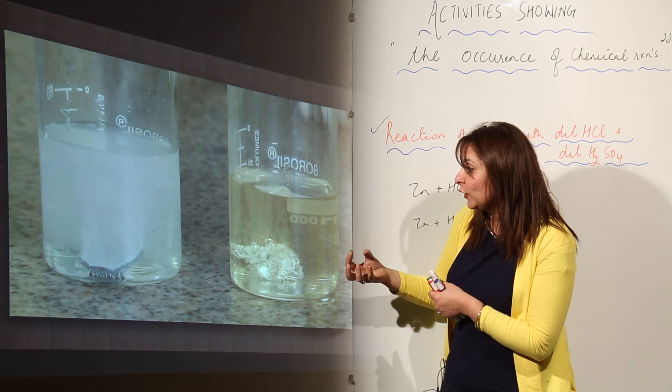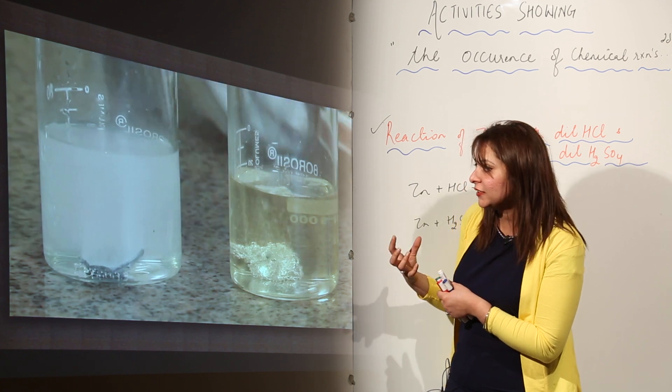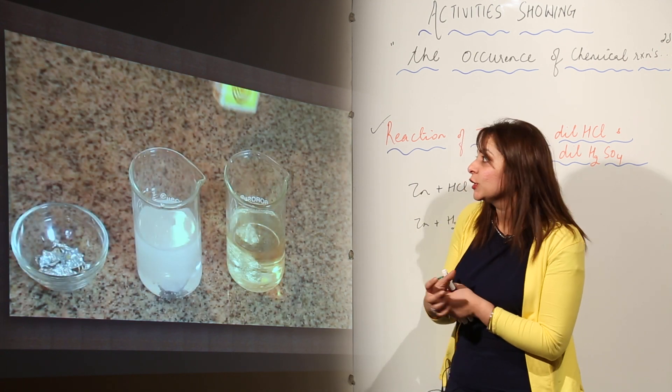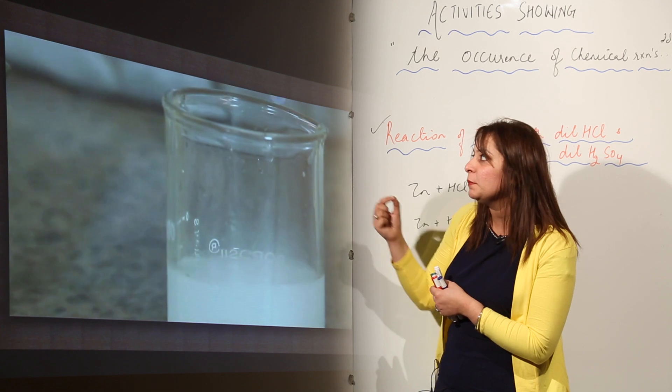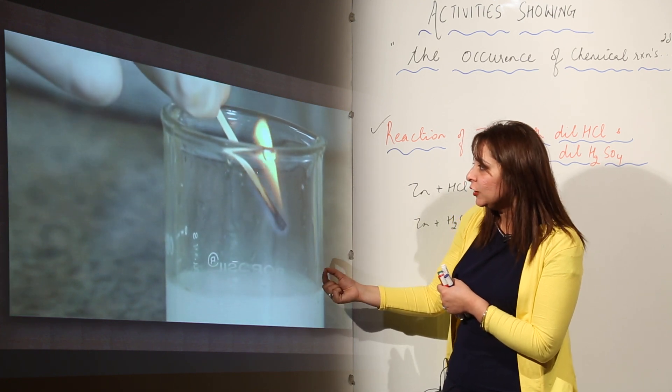See the change, what is happening in the beaker. You can see a kind of gas is being liberated. We just need to identify the gas, so how we identify? We are bringing the match stick dipped in the beaker.